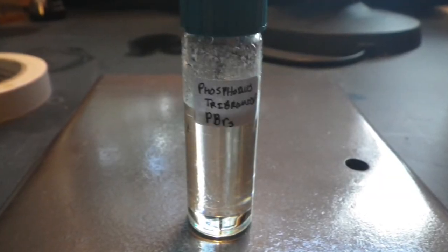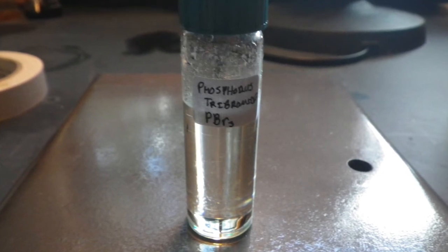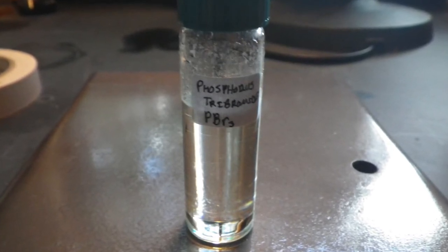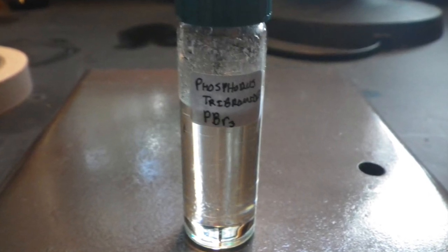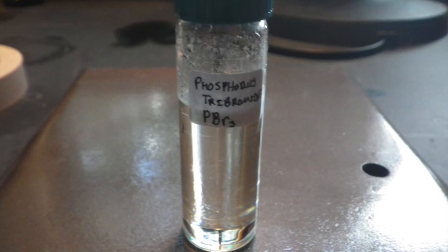Here's the final product, 30.4 grams of phosphorus tribromide, a very dense, clear, colorless liquid that fumes in air. This represents an excellent 87% yield based on bromine.